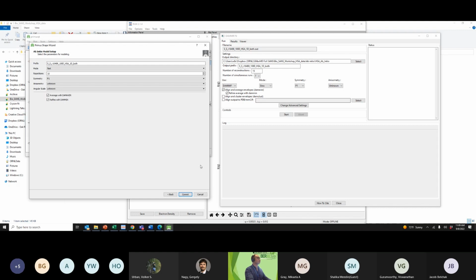So definitely, if you want to do a more refined one, you can use more repetitions, so you have more models that you're going to generate. Basically, the idea is that DAMMIF generates different kinds of those bead models for you, and afterwards DAMAVER, the averaging software, is going to average out those bead models to give you the overall shape.